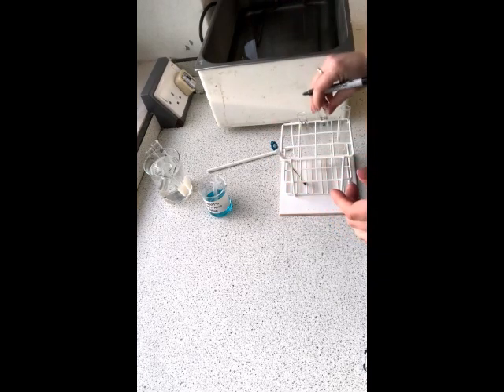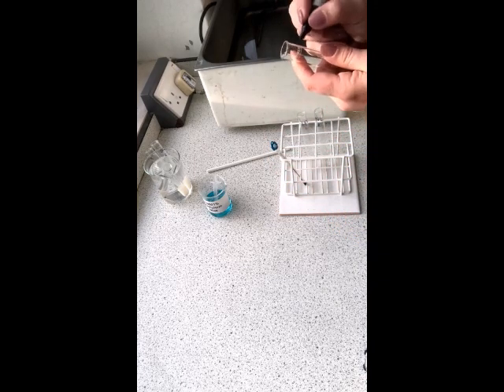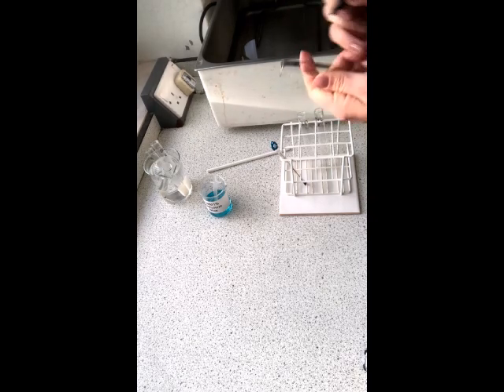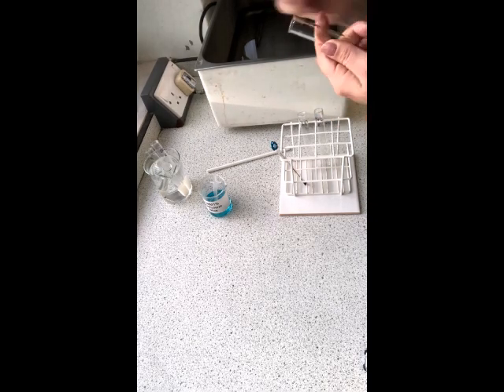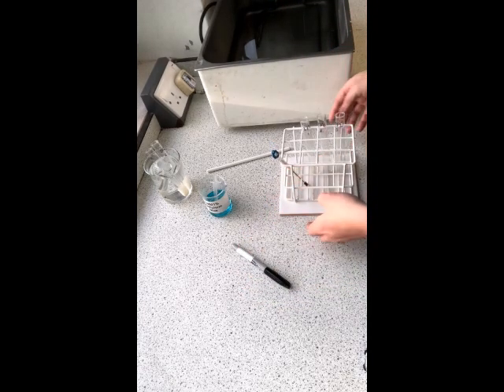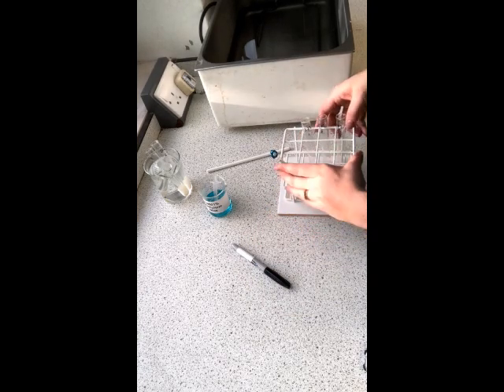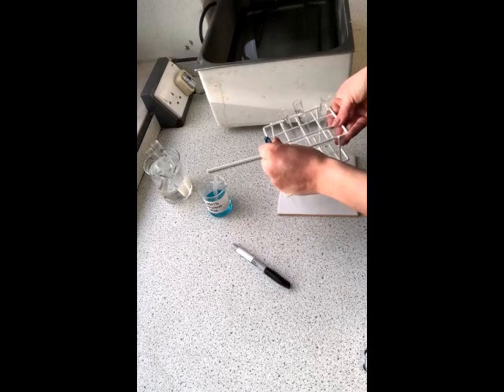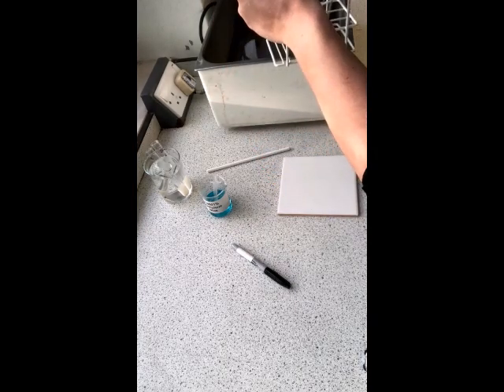Okay, so hopefully you have all predicted that at this higher temperature we should get a faster rate of respiration, because it's not so high that it should cause any denaturing of key enzymes, but it is high enough to increase the kinetic energy and hopefully increase the rate of reaction.